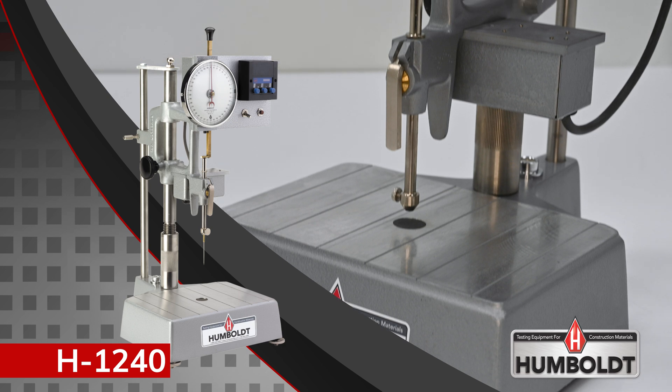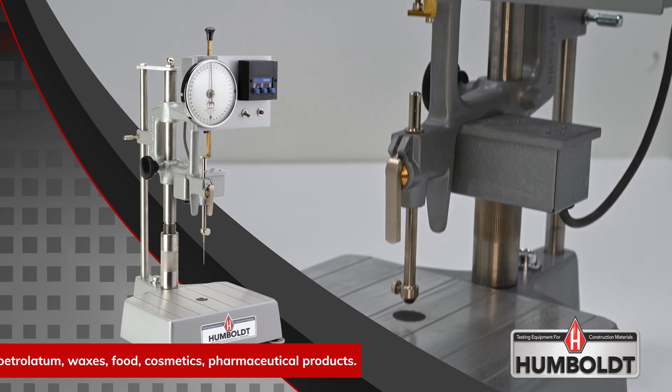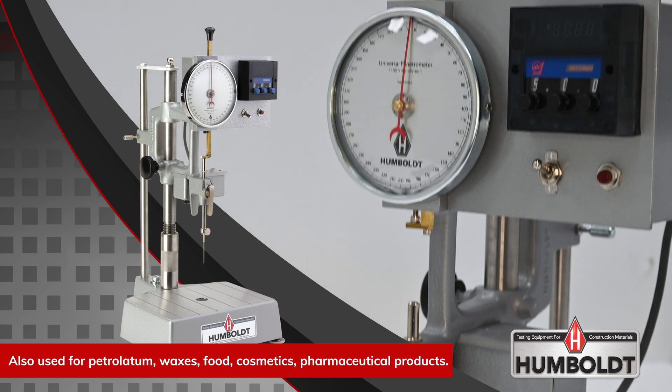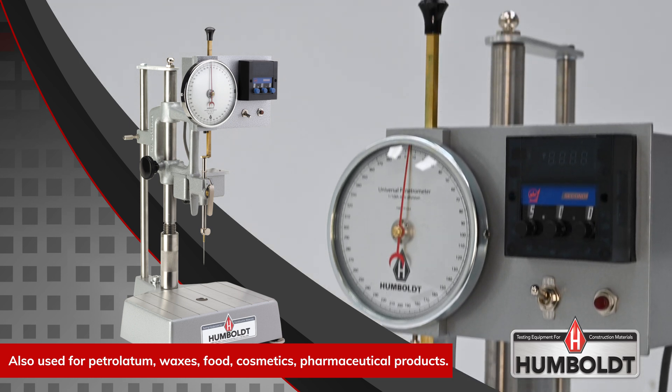Known for their durability, precision, and economical design, Humboldt penetrometers are considered a go-to solution for penetration testing of asphalt binders, cement, and mortar.